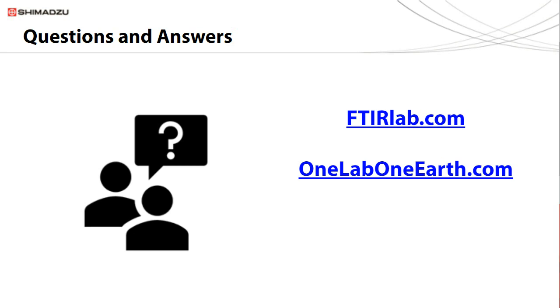Actually, we have included a paper in the resources section for that, so please take your time to go over it. In addition, I can think of the old-fashioned way to get around this to some extent. One can analyze only a part of the spectra or certain peaks to get more understanding of the unknown. Finally, with newer software, there are solutions available that can aid in identifying unknowns in a sample if information about one or two more species is fed into the software.